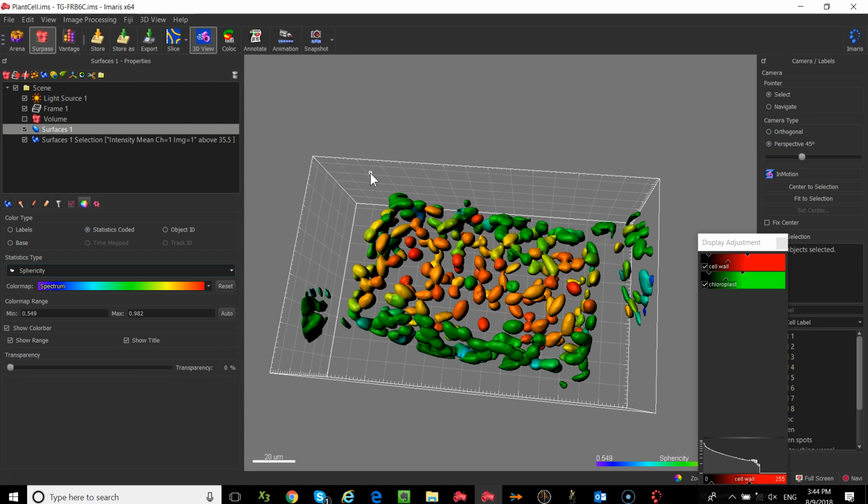I just have, if you could explain quick. We used the chloroplast, which were stained completely.